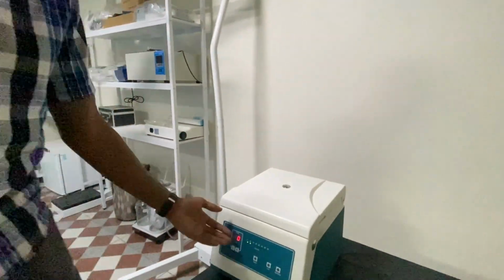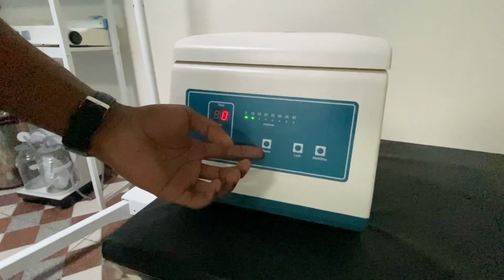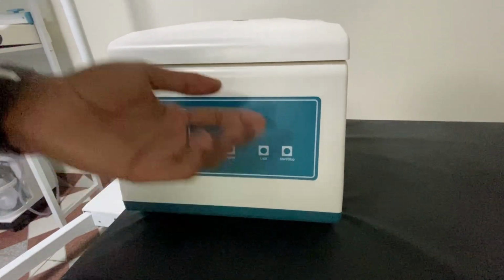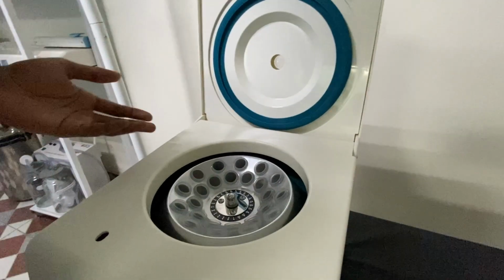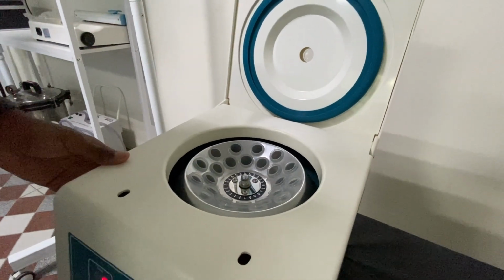As you can see on the panels here, we have the timer, the speed at which you can set the speed from here, and the rotations per minute. And to open it up from here, you just click the lock and it opens up to reveal the inlet for the test tubes. So these can hold up to 24 test tubes.